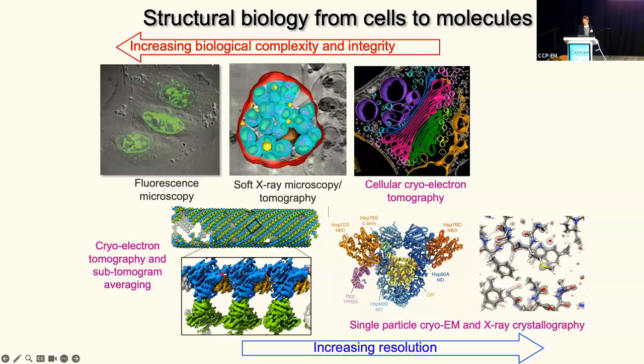The microfluorescence imaging is a tricky business. Trying to have a database and a system for really looking after all the fluorescence images is more tricky. That's a kind of separate operation, but we do need to link to that to plug into correlative microscopy.